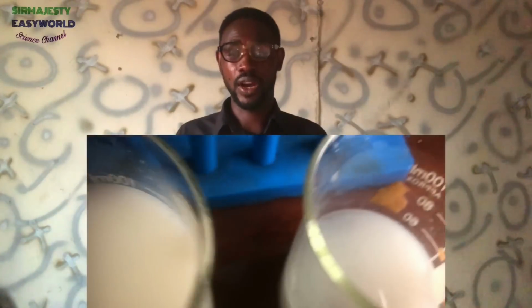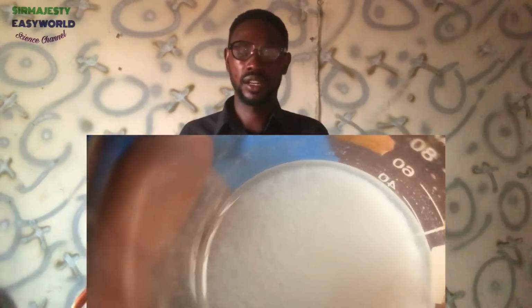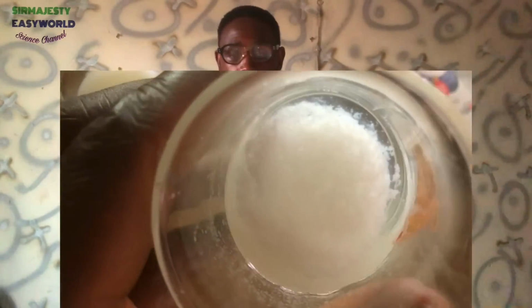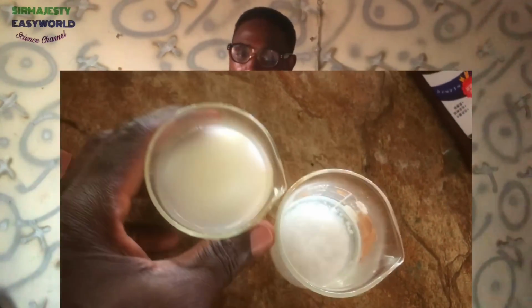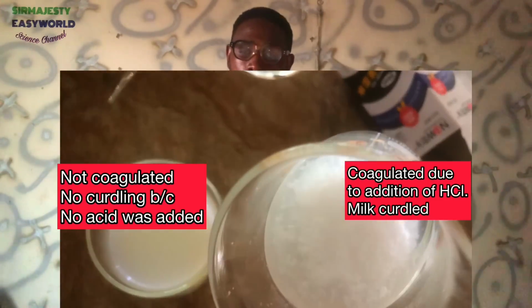But here, just know that when you are told to add 2 molar HCl to milk, you say curdling or coagulation occurs, or insoluble precipitates occurred, and you say decrease in pH induces coagulation of milk. So reducing the pH will automatically induce coagulation. But if you add soda lime, it will increase the pH, and milk will not coagulate at that pH.